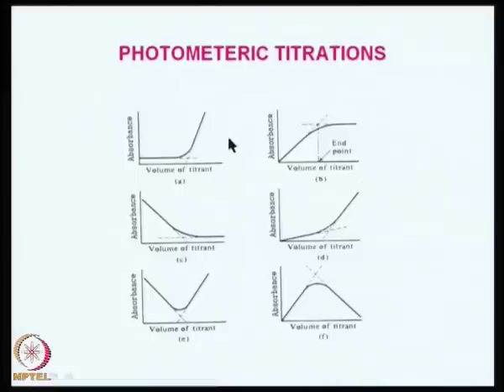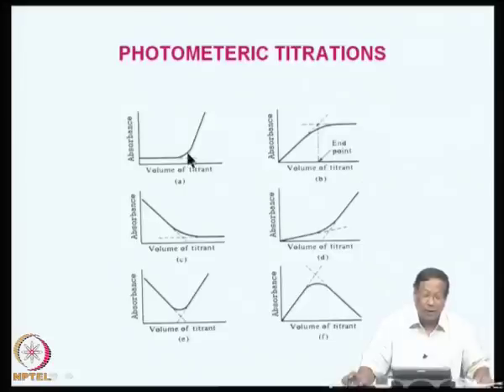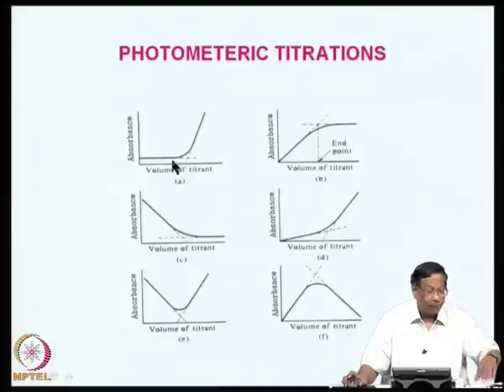So, I am showing you here some of the titration curves. Here you can see that the volume of the titrant and absorbance curves are plotted. The first one shows that initially the color is not changing. At the end of the titration, the complex is formed which absorbs, and the absorbance keeps on increasing. Now, the end point would be obtained by taking a tangent like this, and it can be determined.